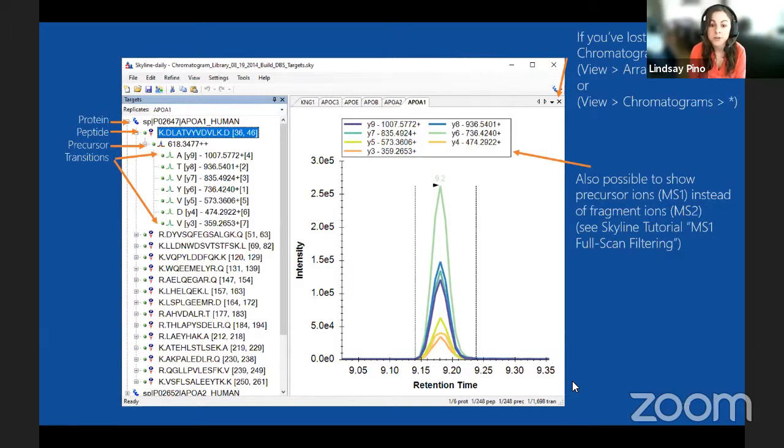Deciding whether you're going to look for a +2 or a +3 or a +4 is part of method development. And commonly, you can use a rule of thumb based on amino acids. You can predict whether a +2 or a +3 might be more abundant based on the charges of the amino acids. However, I think commonly in practice, most mass spectrometrists will just shoot the peptide sequence and see which one is more common, +2, +3, or +4.